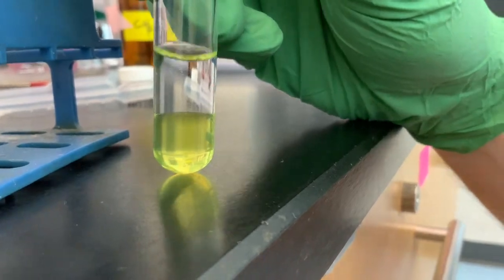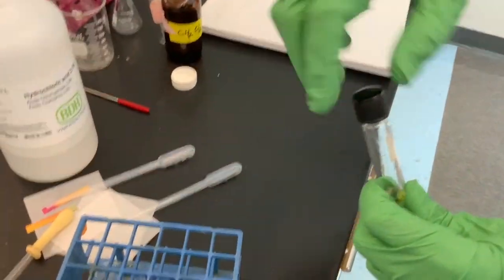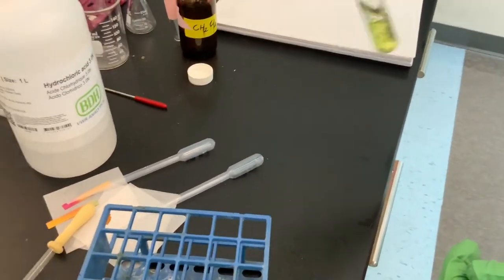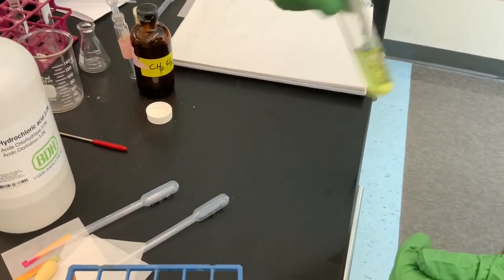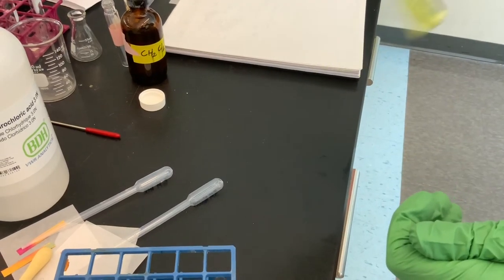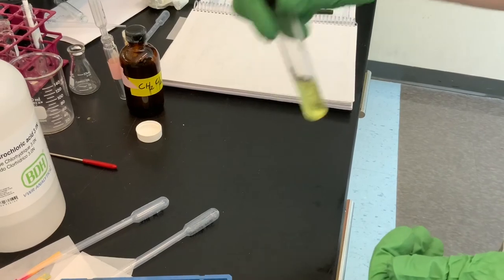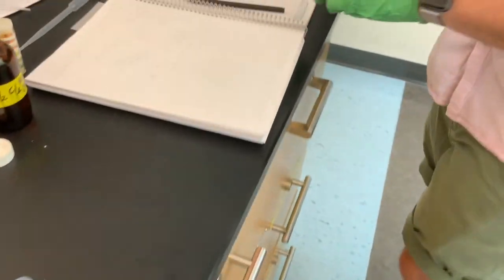Okay, so I'm gonna cap it now, shake it, just like we did before. And what's going on is that I'm deprotonating the neutral benzoic acid, and as a result, I'm removing it from the organic layer, and it's going to dissolve as its sodium benzoate salt in the top aqueous layer. So let's take a look at the structures as I'm mixing this.